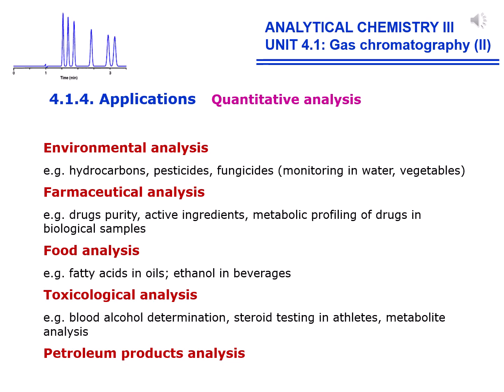Some application areas with concrete examples where gas chromatography separation is widely used are shown in the slide.